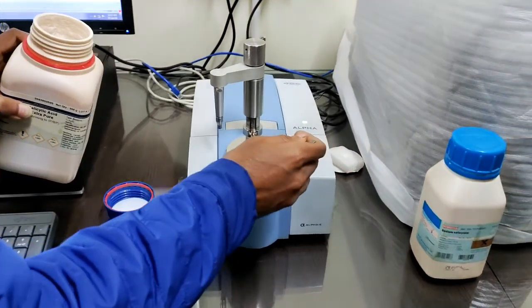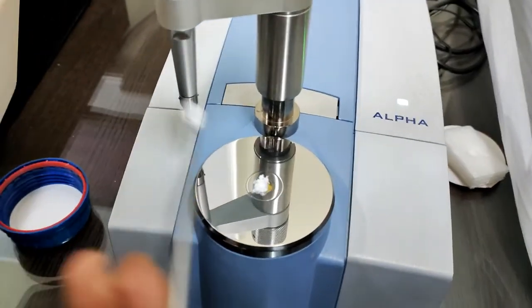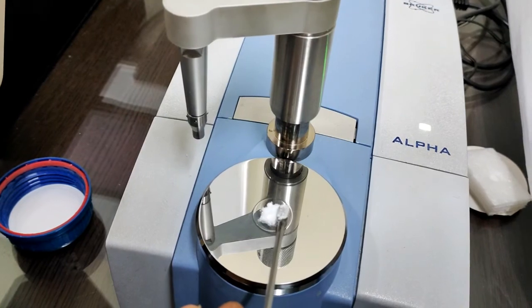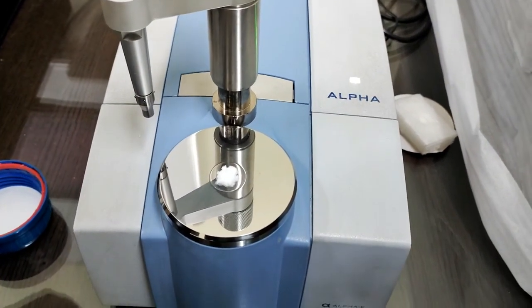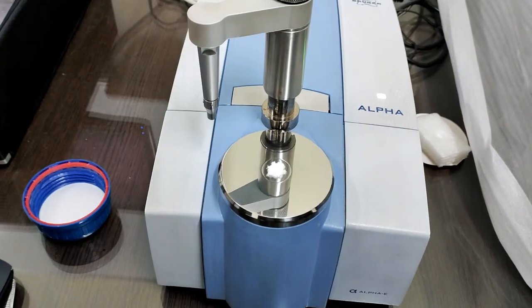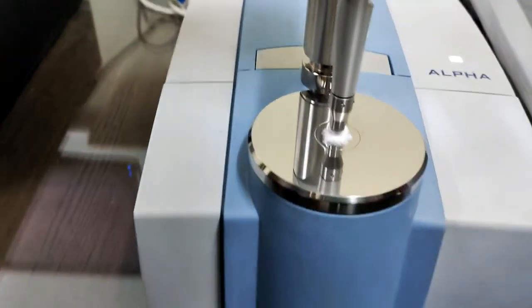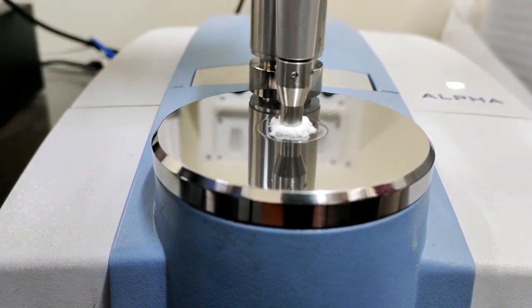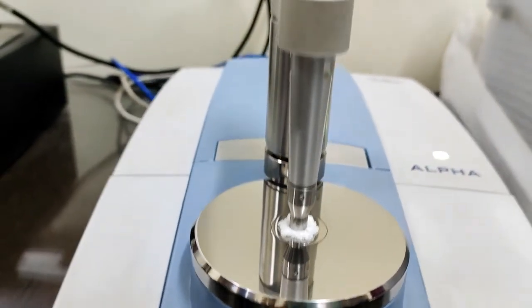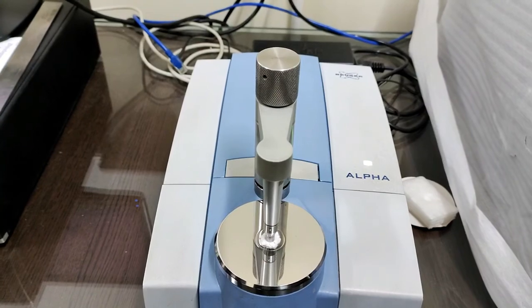Now we will load the sample. You can see how the sample is loaded here. Now the sample is loaded. Now let's go to the software part.